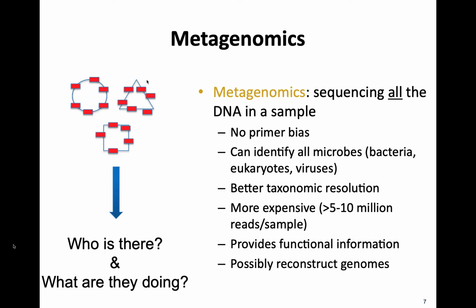The downside, of course, is that if there's host DNA in there, you're going to get host DNA. So if you're doing something like the saliva microbiome or skin microbiome with metagenomics, you're going to have to filter out a lot of that host DNA. That means you're going to have to sequence more to account for losing all of that data. Typically, with saliva microbiome, we're talking 90–95% human DNA if we're doing metagenomics. Maybe sometimes you get lucky at about 80%, but still a large portion is going to be human DNA. You have to remember, human cells are bigger. You're going to extract those, and they're bigger genomes.